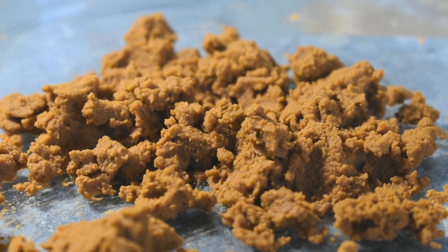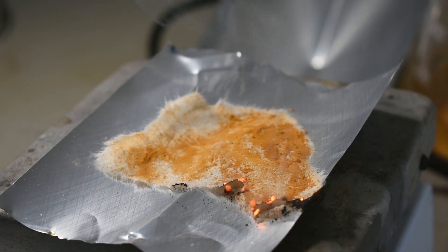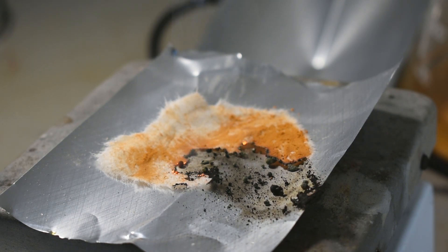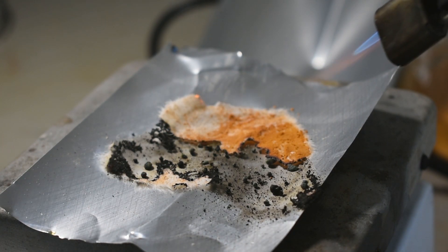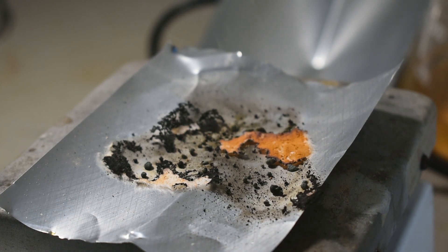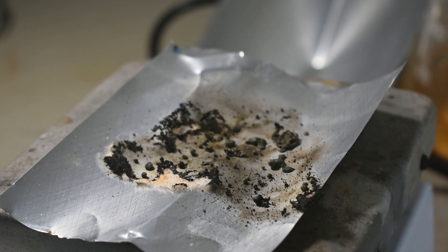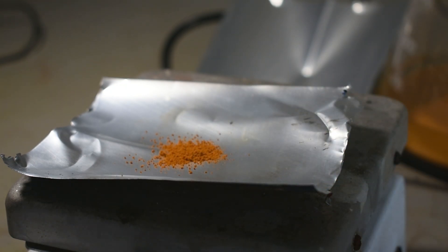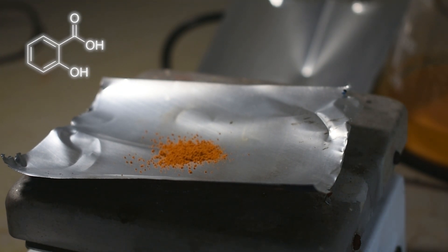Now, let's take a look at some of the properties of this complex once it's dry. Considering the sheer amount of nitro groups this complex contains, it's reasonable to assume that it's going to be pretty oxidizing. As you can see here, some filter paper that has been dried with a residue of our complex on it easily burns, and we can see the oxidizing properties of the complex quite well. Encouraged by these results, I decided to see what else it could react with, starting out with something relatively simple — salicylic acid.